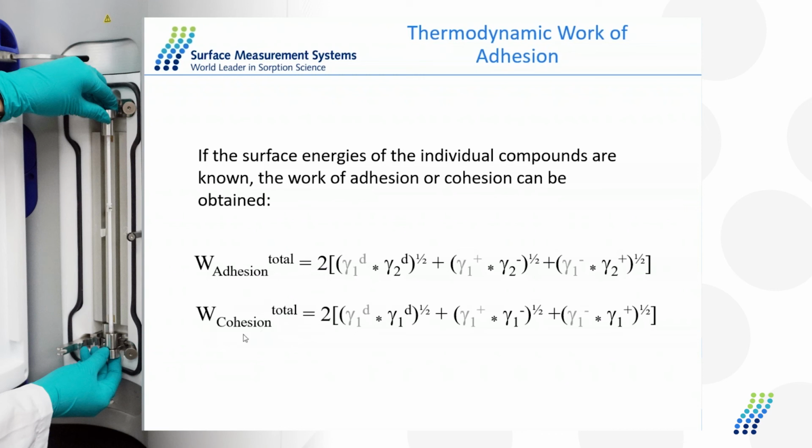Someone else had asked, do you find any significant differences in surface energy in crystalline polymorphs?